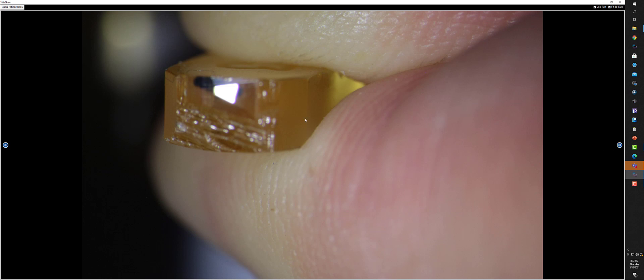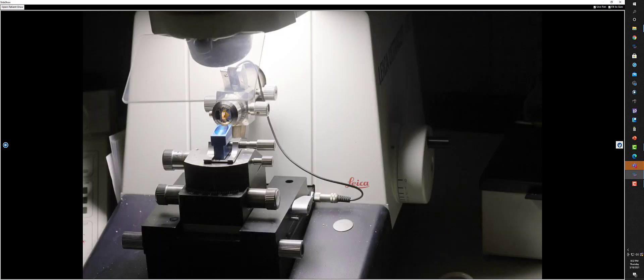That's another view of it. The reflected light off it, you can actually see how big. This is the actual size of the first pyramid. So it's a much smaller pyramid.